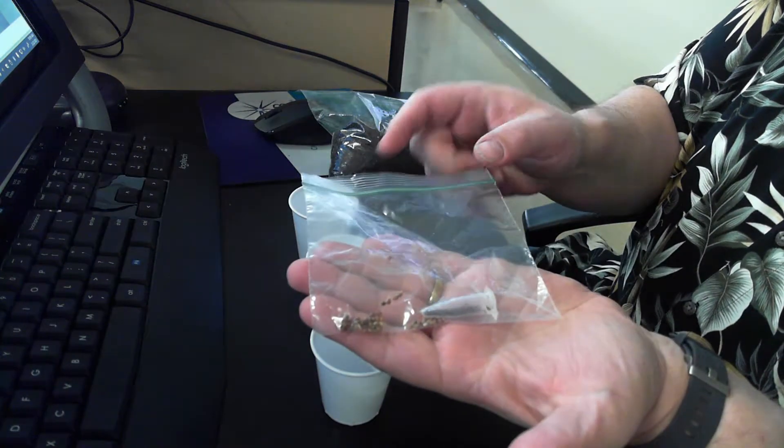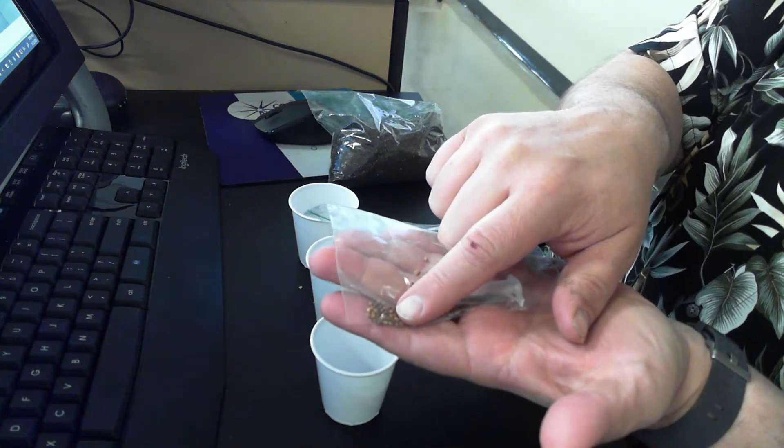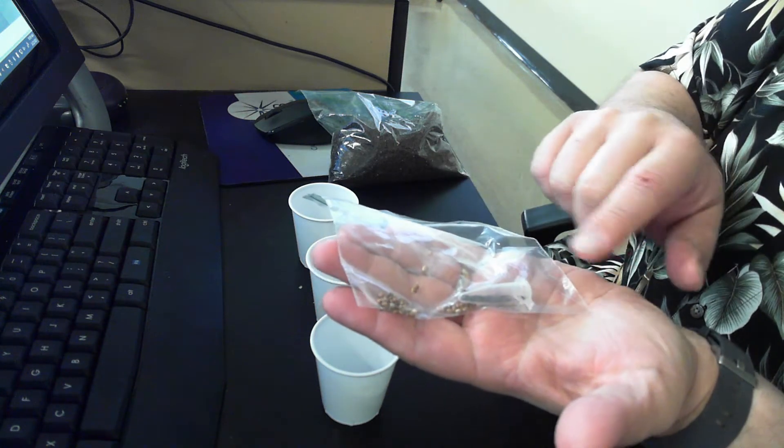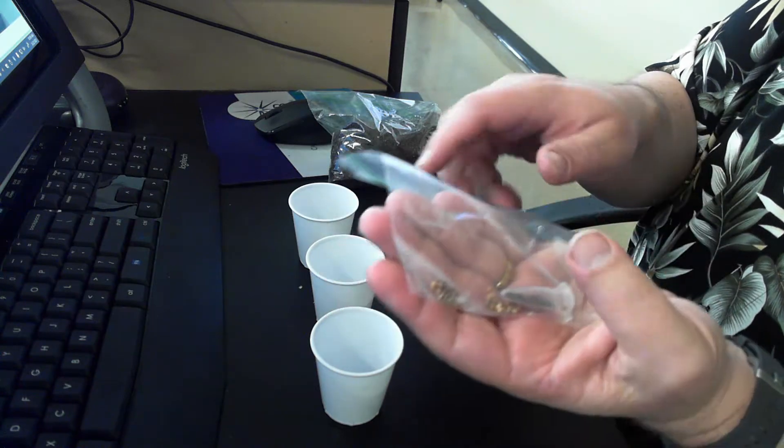Remember in the seeds, these round ones in the plastic bag, those are the radish seeds. That's what we want this time. The lettuce seeds we're not using right now.